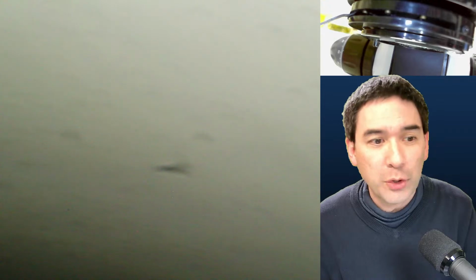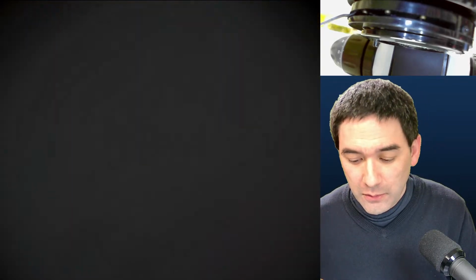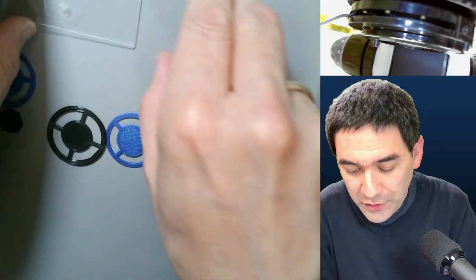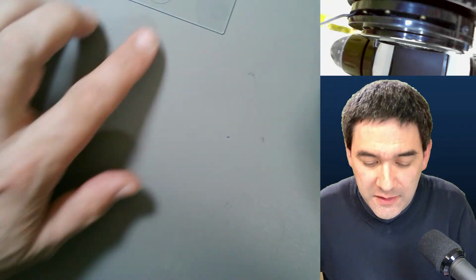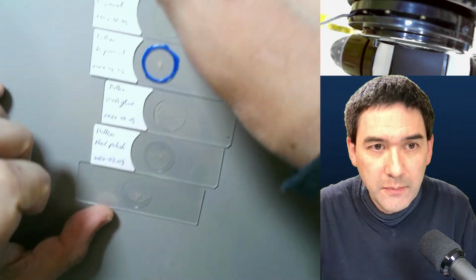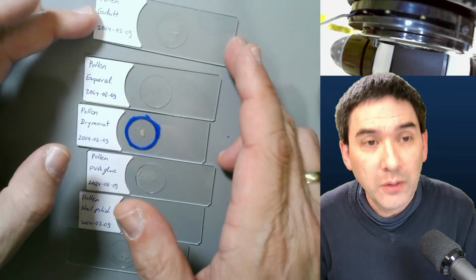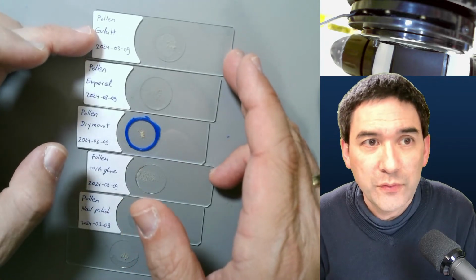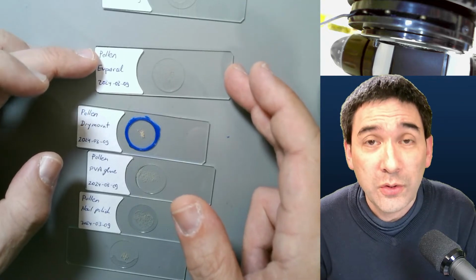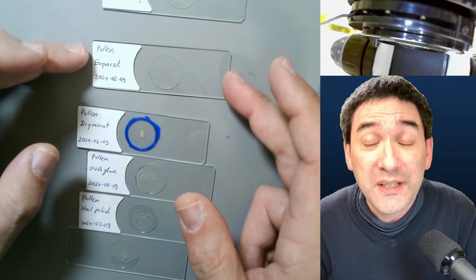I would like to now show you, just for a change, no, let me switch over to the desk first. I just want to give you a little overview of what I've got here. All of these are pollen grains, and I'm just going to run you through. This here is pollen mounted in Euparal, which is a resin-based, hydrophobic mounting medium. Many of you already know it. It's also one of my favorite ones, usually used for mounting insects.